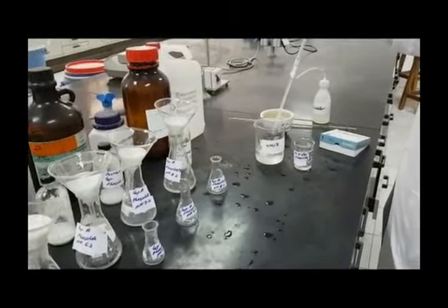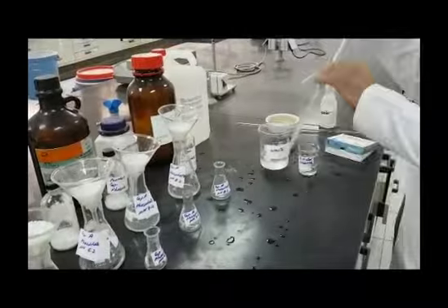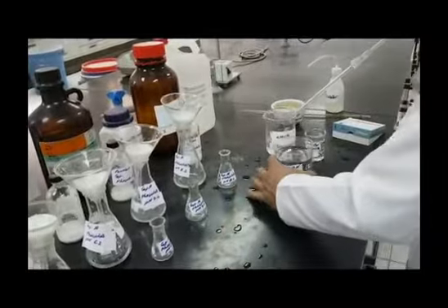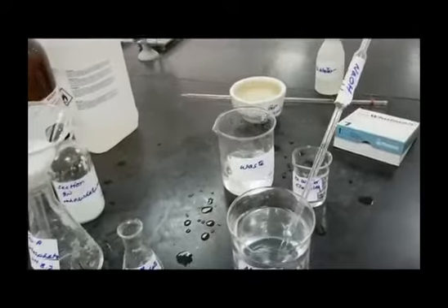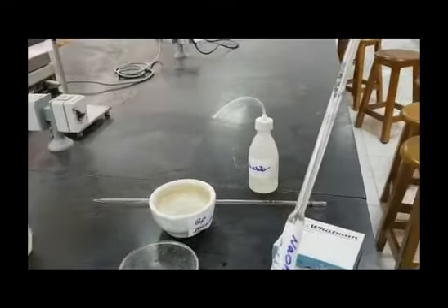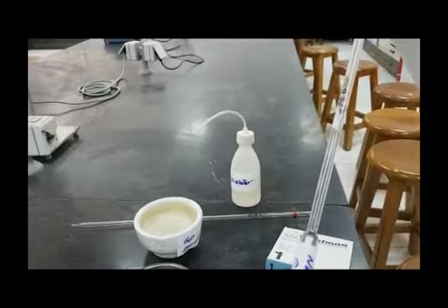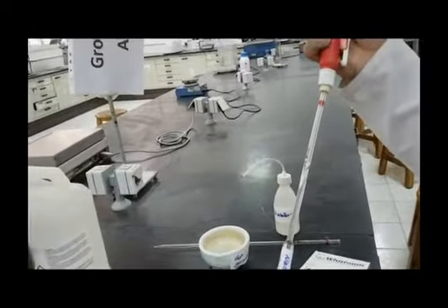Clean these pipettes using distilled water. Place enough water in a separate beaker and use it to clean your pipettes thoroughly. In a clean labeled beaker, bring a sufficient amount of 0.1 or 0.2 normal NaOH, depending on what is available to you.